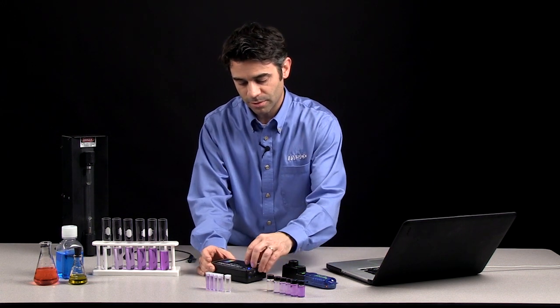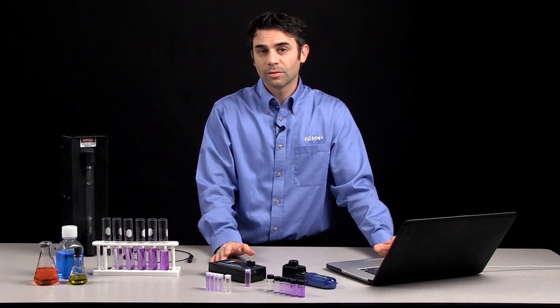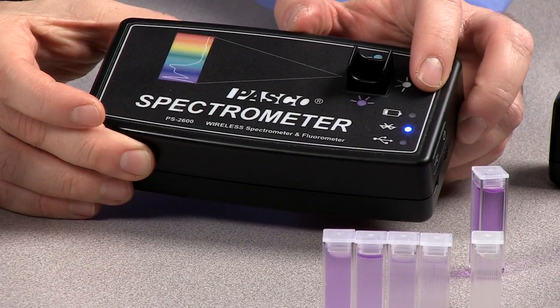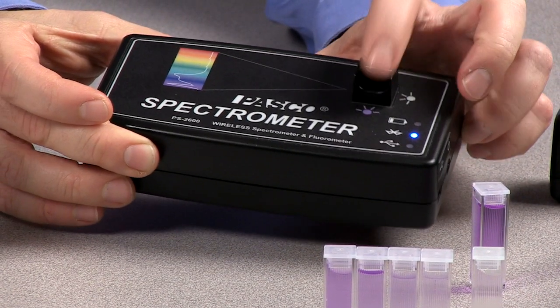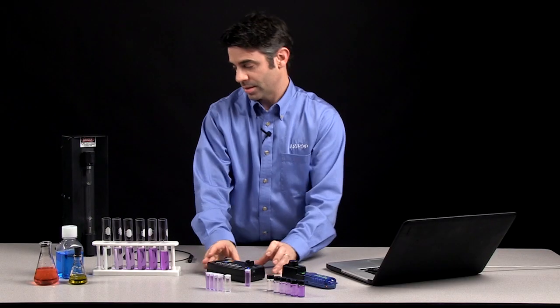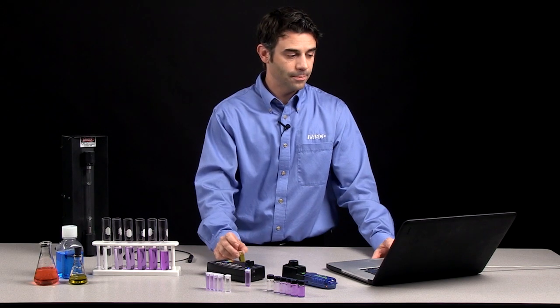The other nice thing about the spectrometer, in terms of just simply analyzing solutions, is the spectrometer has built-in fluorescence support. So not only is there the white light source, there's also a green and a purple excitation LED for fluorescence. So I can put in a sample that will fluoresce, like olive oil or fluorescein.